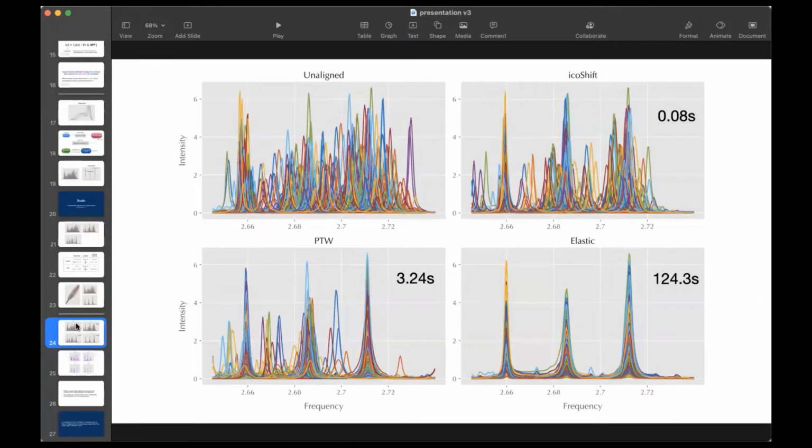The other thing I wanted to ask was about your Karcher mean. The word mean always raises with me the question of how robust this is. I noticed that peaks sort of hop. It looks on some of the pictures as if a peak is in the wrong place, and it's a discrete question about whether a peak is in the right place or not, and that might have to do with a robustness question. Have you looked at that at all?